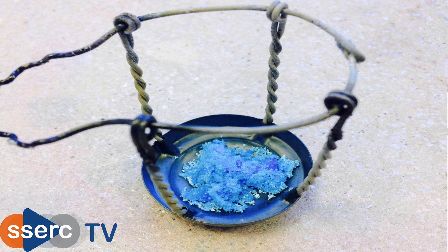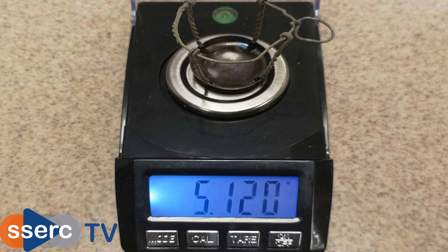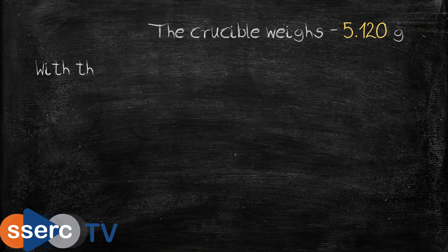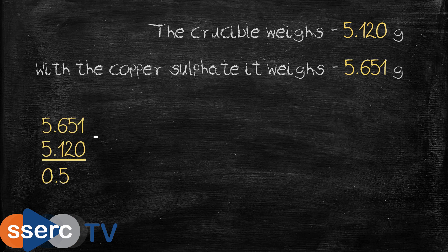Today we're doing this on a micro scale using a bottle top crucible. First weigh out between about half a gram and a gram of blue copper sulphate. As you can see we have just slightly over half a gram here.